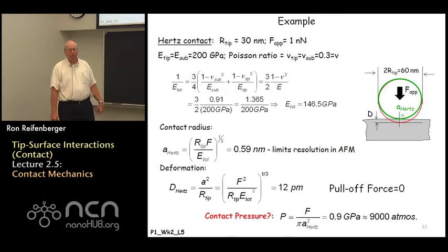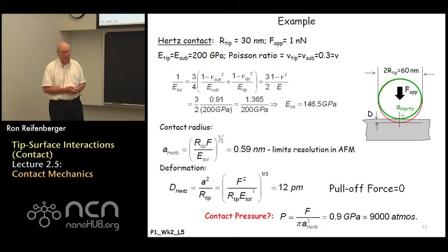Do I believe that result? Probably not, because I don't know what it means when you apply that force over a radius that's only 0.6 nanometers in size. So these numbers have to be taken, I think, with some eye towards skepticism. You just can't believe these things. But nonetheless, these are the results. This is an example of the predictions that these models allow you to make.